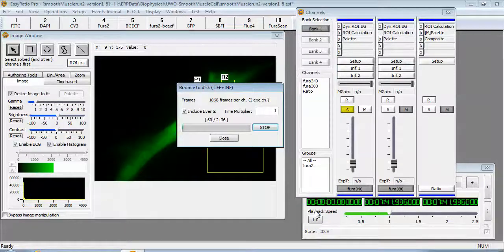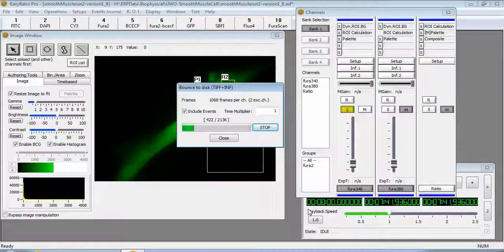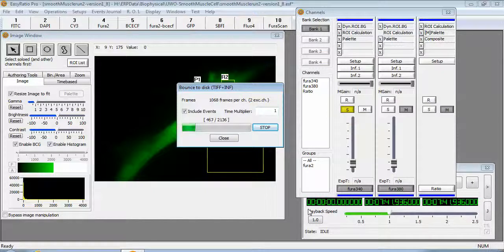Next click save and you'll see that the data will be automatically exported. Once this is done I'll show you how the import procedure works.